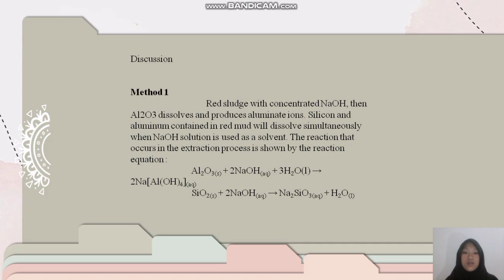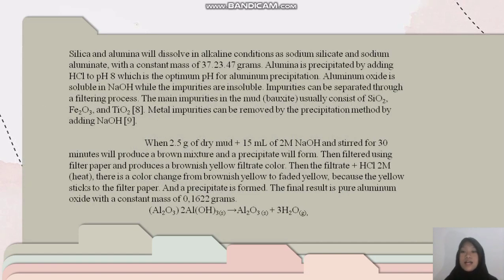The reaction that occurs in the extraction process is shown by the reaction equation. Silica and alumina will dissolve in alkaline conditions as sodium silicate and sodium aluminate.